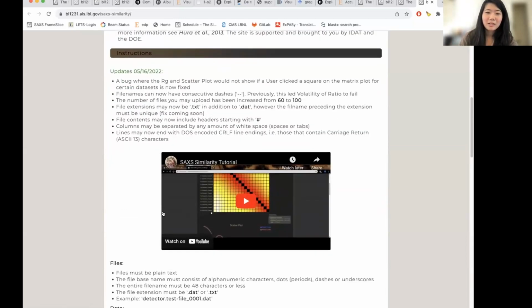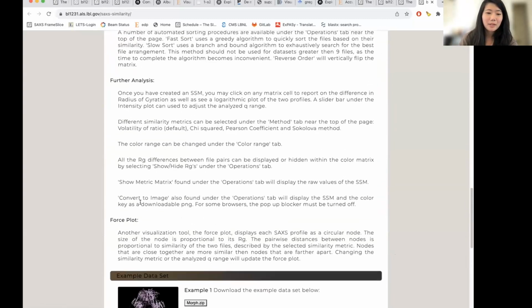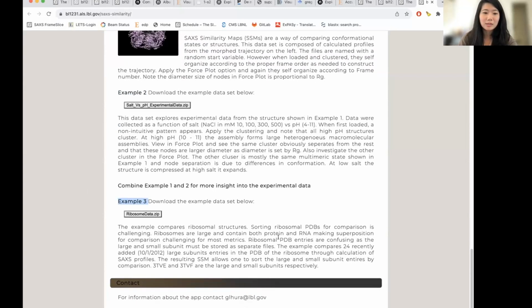I think my recording will be available, but if you want to listen to Greg talk about this tutorial, then there's the YouTube video you can watch. A couple other smaller details like instructions, file formats, data formats. And all the way at the bottom here are the 3 example data sets that I introduced you to today. So we went over example 1 and example 2. Even though you saw me doing this, it would still be a nice practice for you to download and try this out on your own. And definitely try out the ribosome data set in example 3 and see what you can do with this.